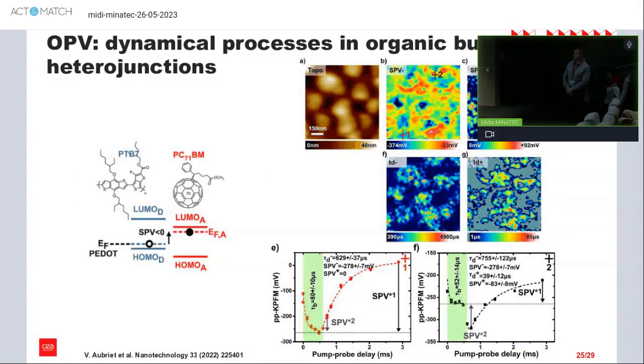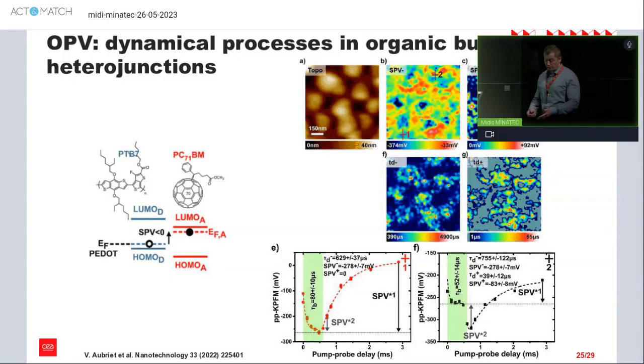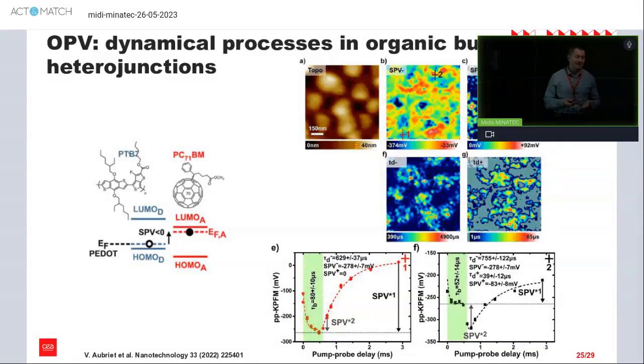It depends, yes, but you must very often take into account that it can destroy the sample. In AFM, the aim is that you must control the vertical force, so how much force you put, to destroy the sample less. But with contact mode, yes, you can destroy your sample, especially if you have some fragile materials.